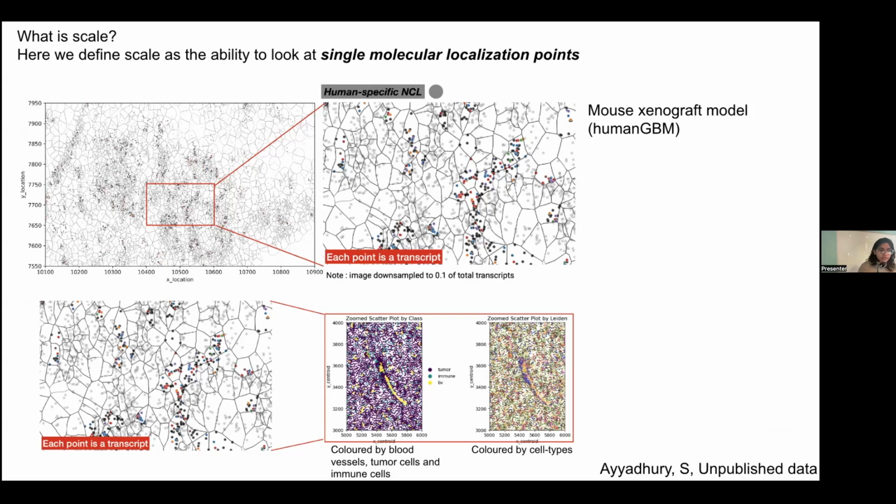And that's how you see scale. Scale is driven by the platform itself, which is the tech spec. You can download the technical spec sheets and understand all of this. And next, it is also driven by what it is that you want to query.